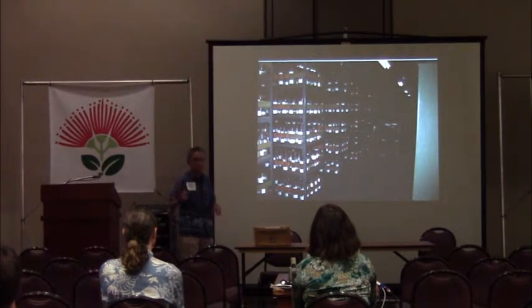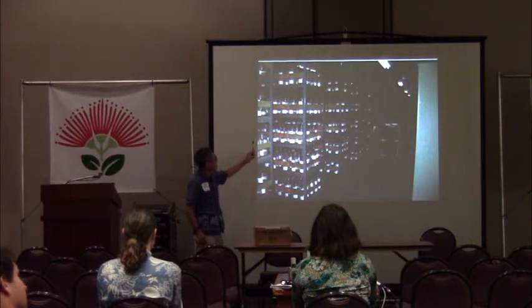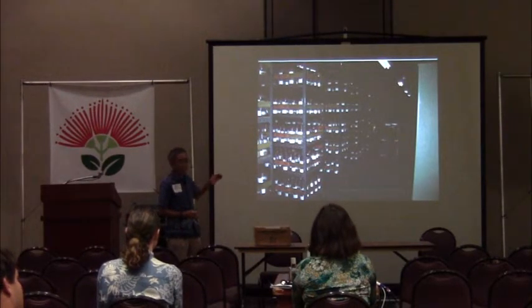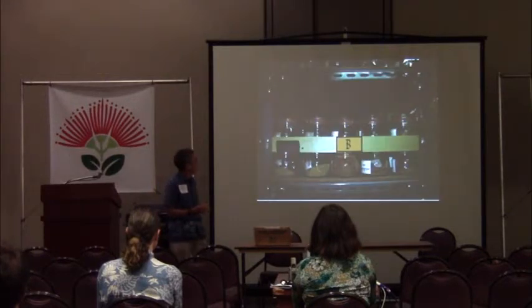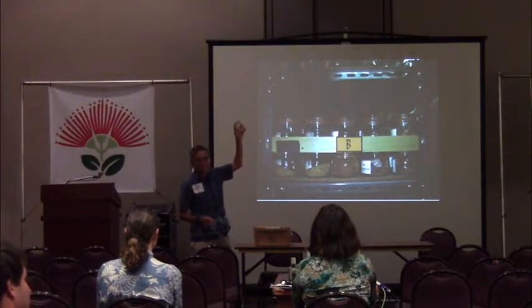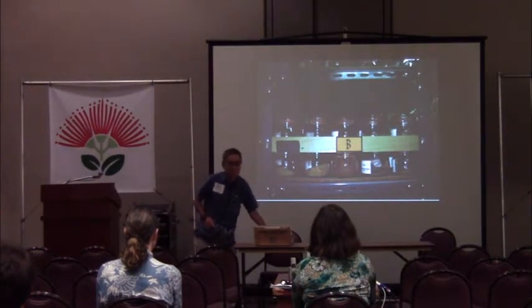In a self-defrost refrigerator, moisture level is just about right for seed storage. So if you're going to use a self-defrost refrigerator to store seeds, Ziploc bags are fine. But in a walk-in refrigerator like this, the humidity is very high, so they have to keep their seeds in airtight containers once they're dried for storage. Next slide. Here's a closer-up view of the airtight containers. You can get exactly the same kind of containers at Long's Drugs.